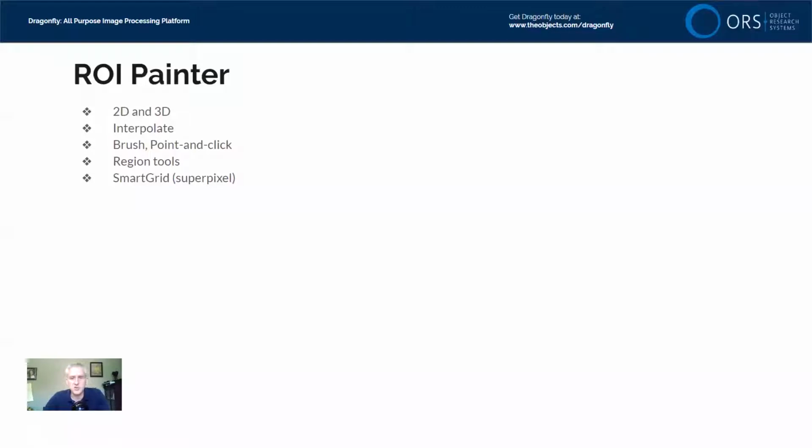Now, the two data sets that we're using for today's lesson: one is the same data set we used in lesson 8, the data set on the mouse retina rod internal segments from Christopher Bleck's lab at NIH. I'll show you where you can get that if you did not watch lesson 8. We'll also use a data set called Backpack, and I'll show you where we're going to post that.